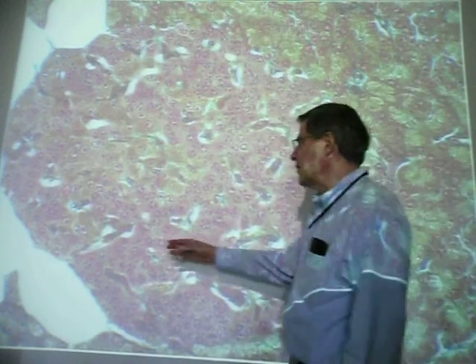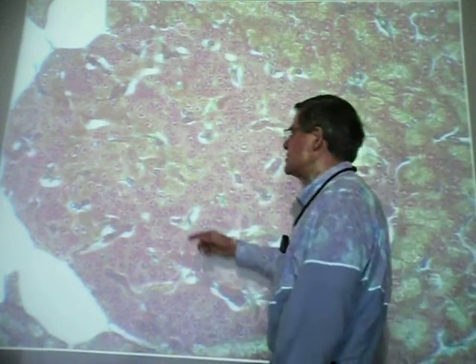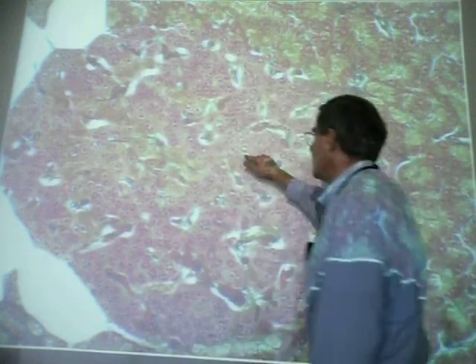Again, you don't have to pick those out to ask what's another cell type, or what does it produce? F cells producing pancreatic polypeptide. Okay, so the cells with pink cytoplasm are beta cells producing insulin. The brown cytoplasm cells, second most abundant, are alpha cells, which produce glucagon. And third in abundance, these light brown or tan cells, as you can see here, here, and so on, are the delta cells producing somatostatin. And then the F cells you don't see here, but they're the ones that produce pancreatic polypeptide.